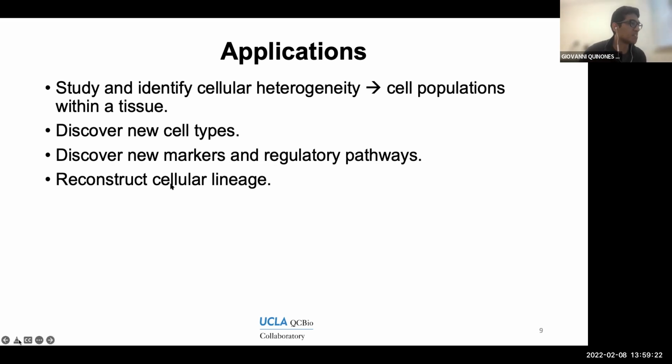To reconstruct cellular lineages, this is what I mentioned briefly about the pseudotime, which is trying to identify the phylogenetic connection of different cells, meaning how one type of cell may derive from another one. And this is something that we can also explore using this type of data.